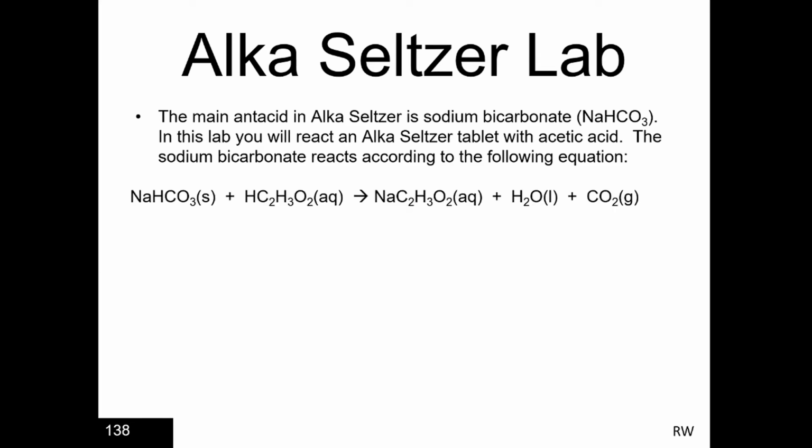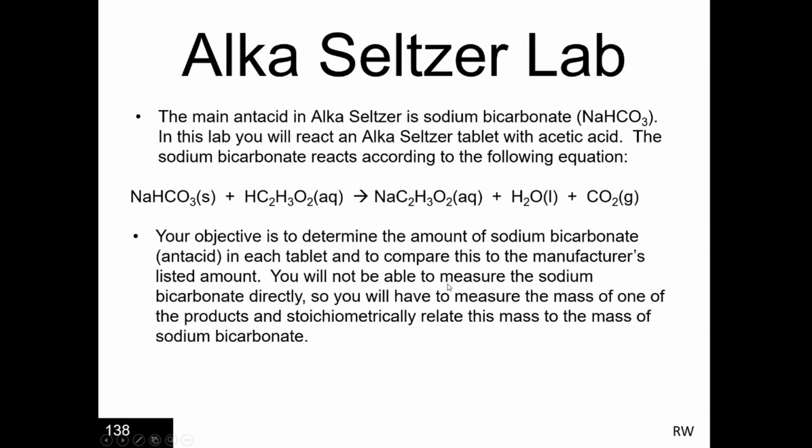Okay, so there's the reaction. The sodium hydrogen carbonate here reacts with an acetic acid here and produces sodium acetate and water and carbon dioxide. So your objective here is to determine an experiment, a procedure, to see if in fact it's correct.